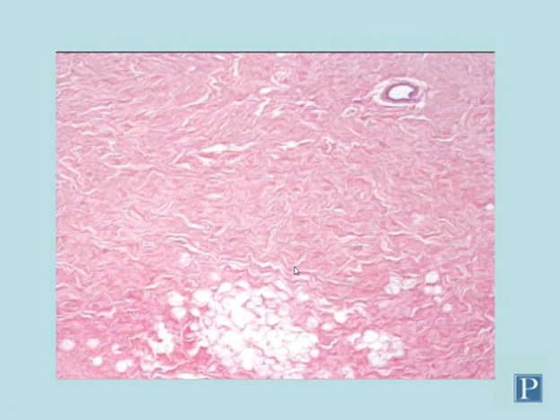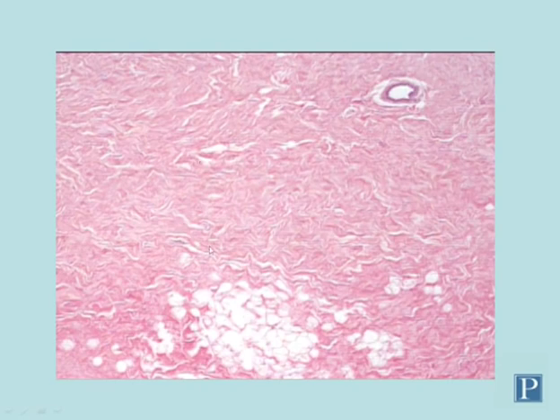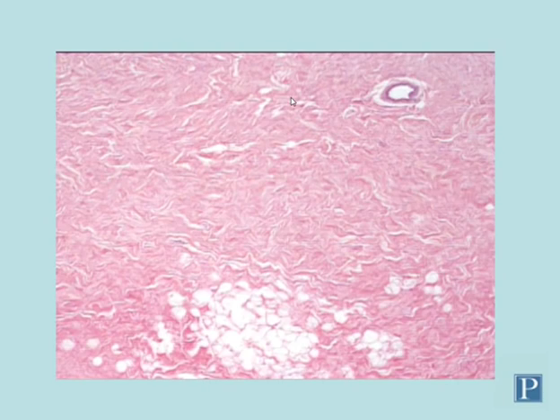Finally, we'll look at the mammary glands, which we're including as part of the integument. This is an inactive mammary gland composed mostly of adipose tissue and dense irregular connective tissue with very little glandular epithelium — you can see one duct but it's very scant. This is what mammary tissue looks like from a woman who is not actively nursing or pregnant.